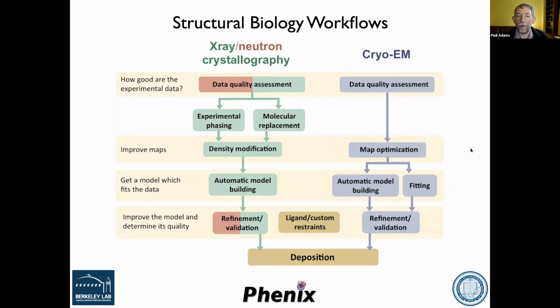One of the good things is that once you've done the experiment to get to the initial data, the process for both crystallography and cryo-EM has a lot in common. So in crystallography, once we get to our processed diffraction data, and in cryo-EM, once we get to our reconstructions, so a three-dimensional reconstruction for the volume, the steps after that have a lot in common. There are details a little bit different, but there's a lot in common.